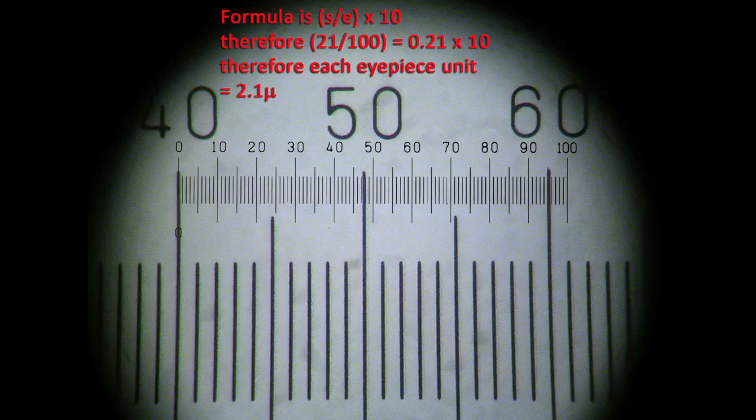So if with a 10x objective each IP unit was approximately 10 microns, then accordingly each unit using this 40x objective will represent 10 divided by 4, or 2.5, and our value of 2.1 microns supports that.